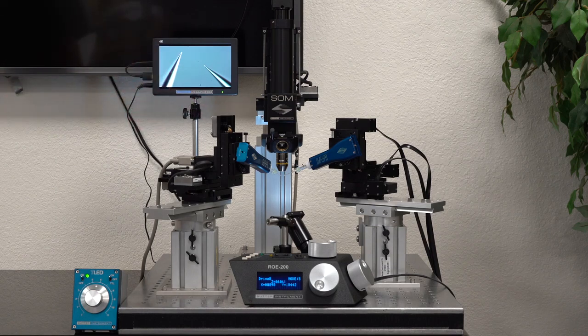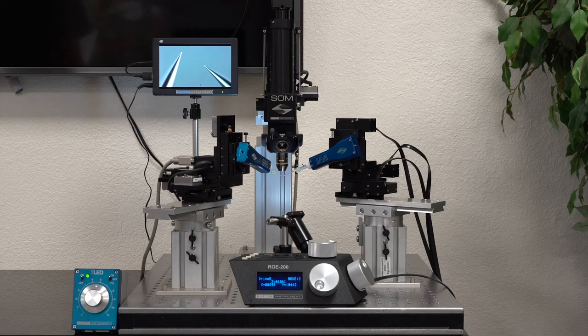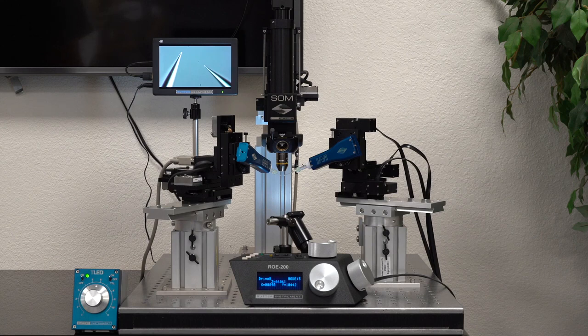SOM rigs have become common in fields like Drosophila electrophysiology where the specimen does not allow transmitted illumination and maximizing space beneath the objective is important.